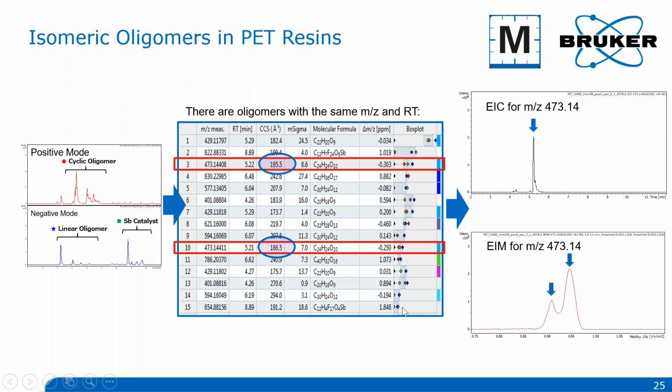So to give you a rule of thumb, this system can typically separate peaks as long as the collisional cross-section of the respective ions differs by more than a couple of square angstroms. You will see the difference between them. And to give you a frame of reference of what a square angstrom is, the length of a single carbon-carbon bond is 1.5 angstrom. A double carbon-carbon bond is shorter, about 1.3 angstrom. And the triple bond is shorter yet, about 1.2. So when you look at these numbers, you realize that we're literally measuring the molecule down to individual atomic bonds. So yeah, that's very significant.